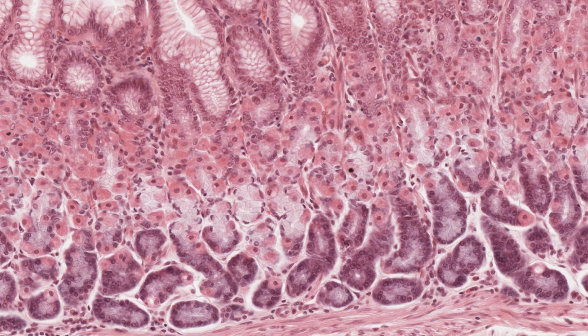Now, just one final point about tissue processing is that within this image, you can see little strands of whitish areas. Normally, that's interstitial or intercellular space. But it's a little exaggerated in this section, and it's exaggerated in a lot of hematoxylin and eosin stained sections. And that's because when you cut a thin slice of tissue and pass it through alcohols for dehydration, it often gives rise to differential shrinkage of different tissue components, resulting in what we see here as false spaces. They don't really occur in the real life of the specimen.